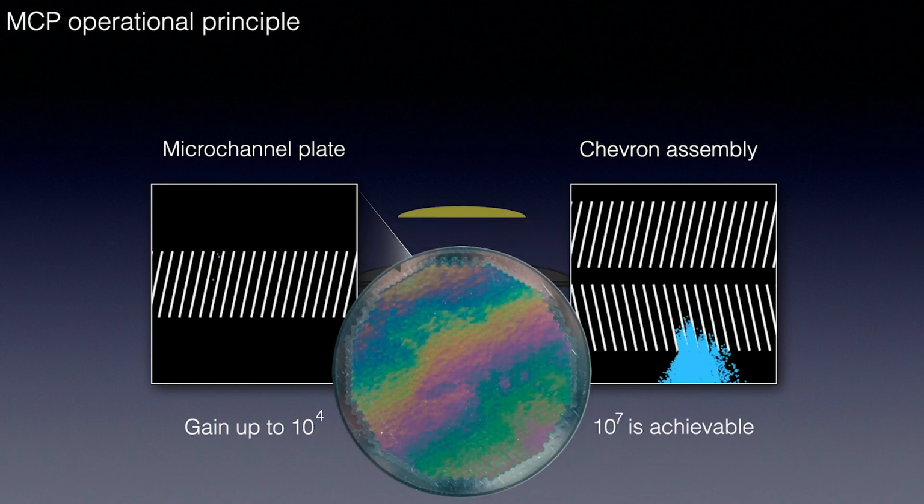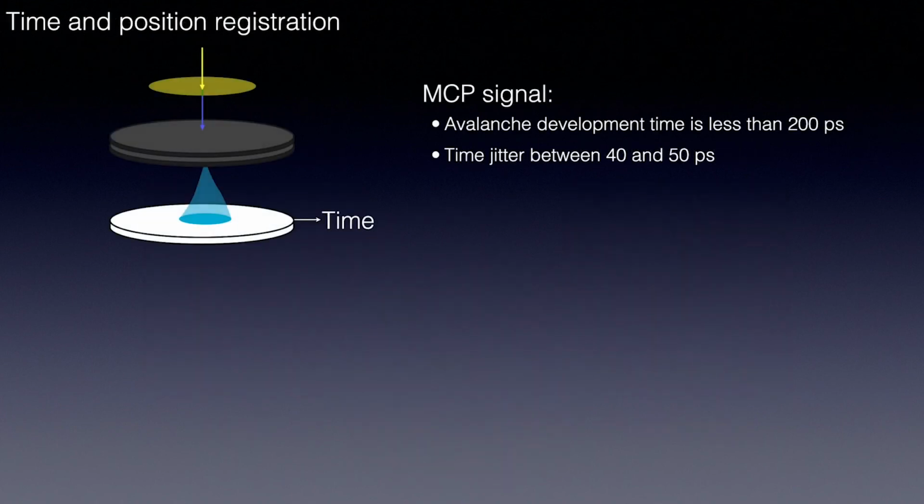This is a photo of an actual plate we use in LINCam. Before SPADs came around, people used such tubes to do time-resolved single photon counting. For that, you just collect the avalanche coming out of the MCP stack and get pretty good timing right out of the box.